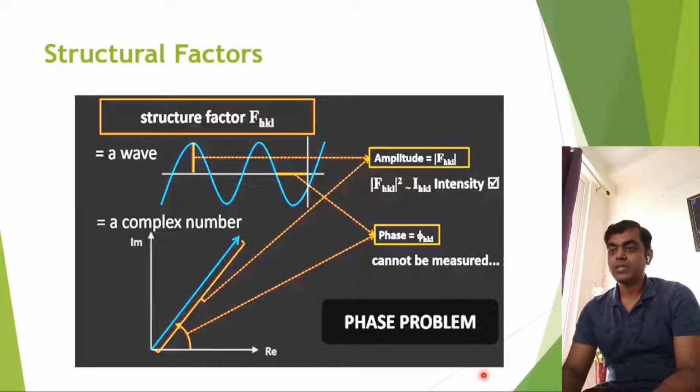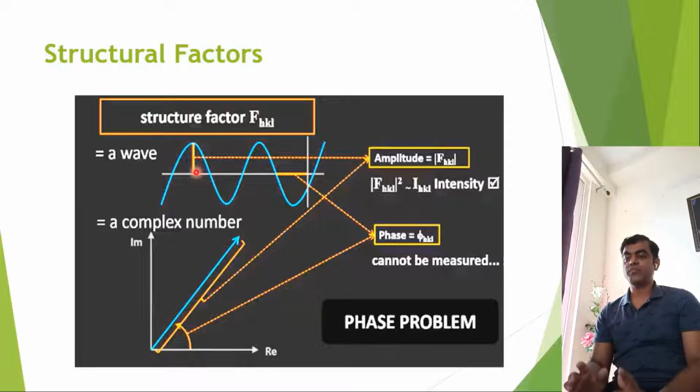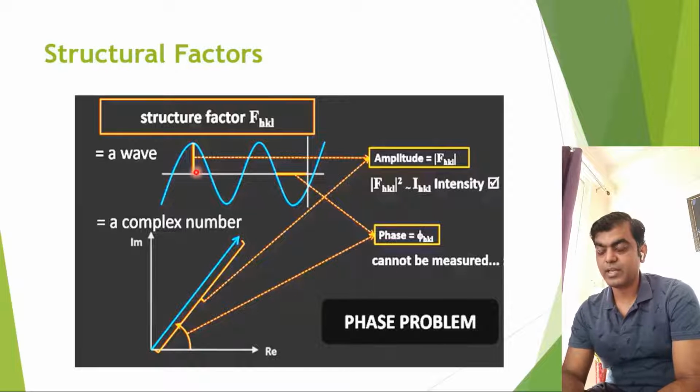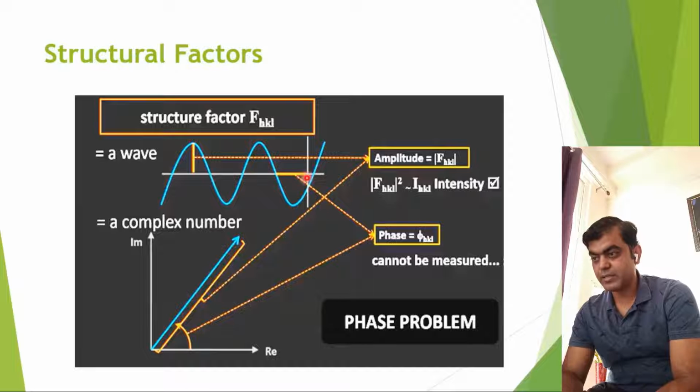How are you going to manage it? So in a structure factor, as I was telling, you have this wave. In the wave you have the information as the amplitude. The amplitude is the function F in HKL. We are now talking in terms of vectors. As I said, there are three vector directions, HKL, in the crystal, and from this HKL the function is the amplitude. This is the function of the amplitude, and we also have the phase function.